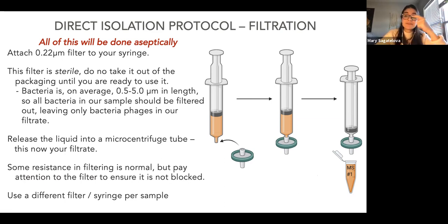Okay, a tip that I give students is that you'll notice on the packaging, it comes with a little container and a little lid that you can slide off. You can take the lid off and just leave it really close to your burner. Not too close that it burns, but close. And then when you're ready, you can just screw it on.